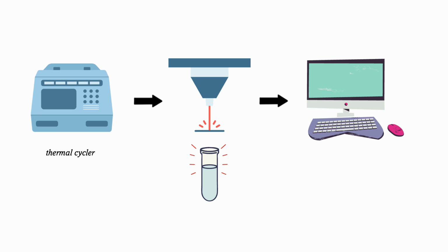Perhaps now you are asking, but how do we make the DNA sample emit a fluorescent light? Well, there are two commonly used methods how to do this. The first one uses a special dye that binds to the DNA. A common DNA binding dye is, for example, SYBR Green.